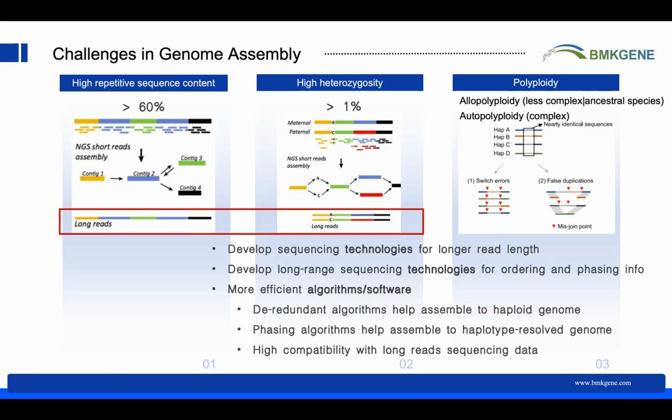It will show us the sequence directly. So if we can use long read sequencing technologies, then most of the repetitive or heterozygosity sequences shorter than the sequencing read length will be solved.